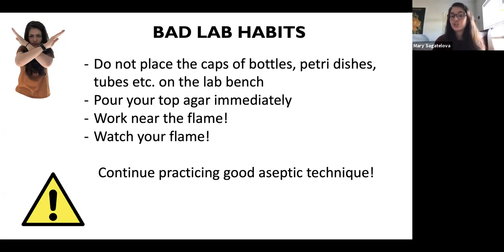And make sure you're watching your flame also. Don't leave it unattended for large periods of time. If you're not using it immediately, within the next 5 or 10 minutes, you can turn it off and then turn it back on. You don't need to leave it running while you wait for something. And if you're noticing any leakage that's on fire, let one of the TAs know. And then continue to practice your good aseptic technique, okay? We build on this in this class, so hopefully we're getting better and better at it.